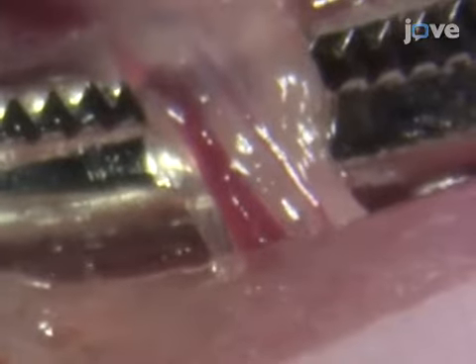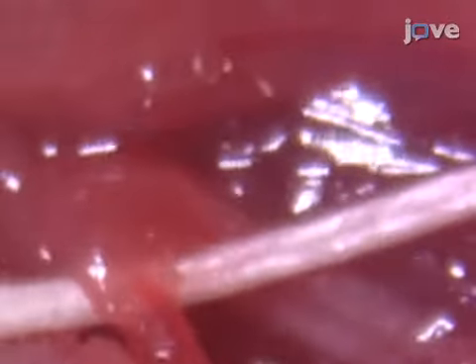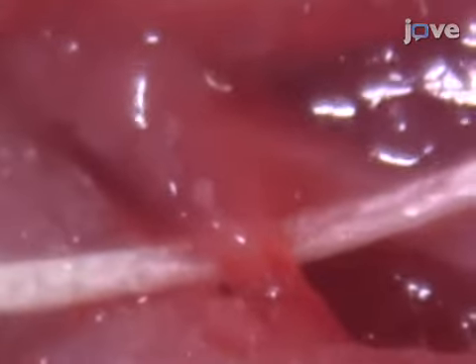Once the angled forceps are in place, further separate the iliac vein and artery from the surrounding tissue, keeping the vessels on top of the angled forceps during the dissection. When the vessels are clear, use the straight forceps to deliver the tip of a 4-0 silk suture to the angled forceps and pull the suture slowly and gently beneath the vessels. Both the iliac common vein and artery should then be held up by the suture.